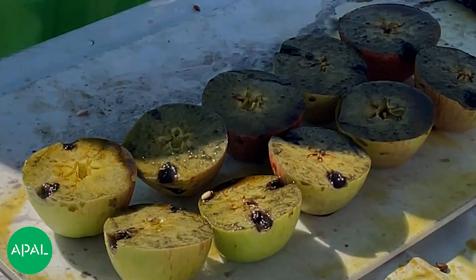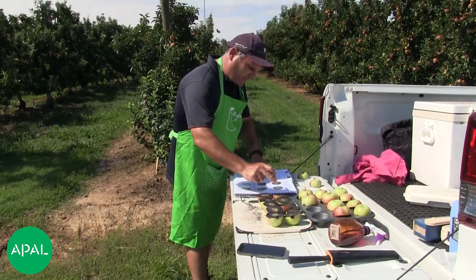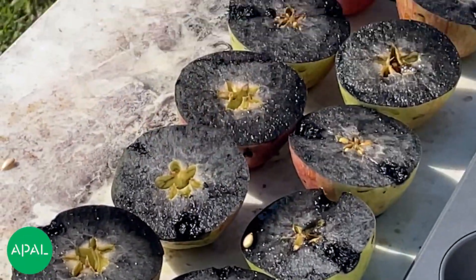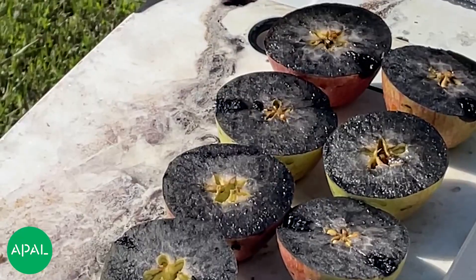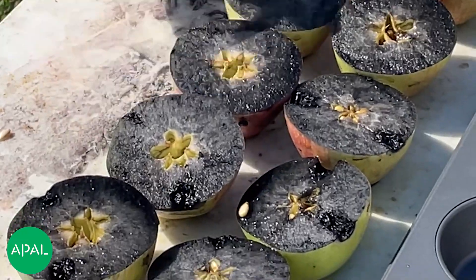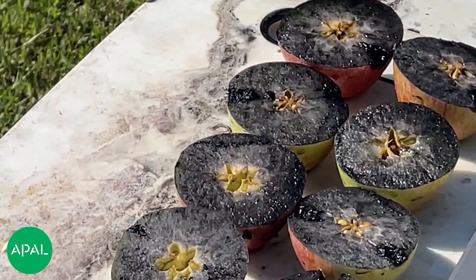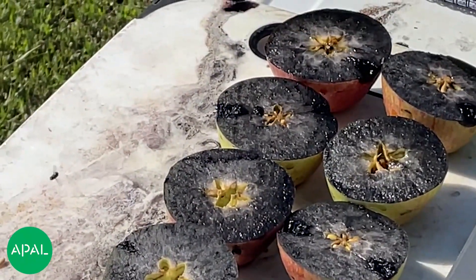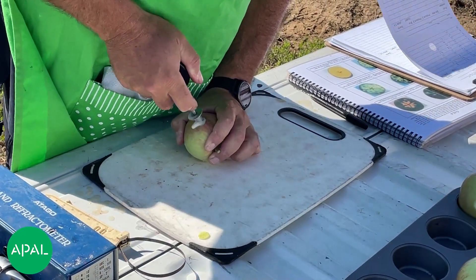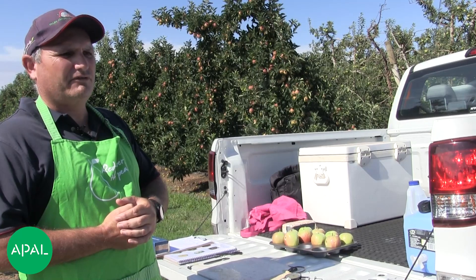After applying the iodine solution, give it about five to ten minutes. Then score each fruit individually. For example: one, zero — no movement whatsoever — zero, one just starting, zero, one, zero and zero. It's important to understand what you can do with your fruit by doing a maturity test, and to make sure the fruit is picked at the right time depending on whether you're going to store it or direct market it. A maturity test will really help give you a good idea of getting the fruit off at optimum maturity.